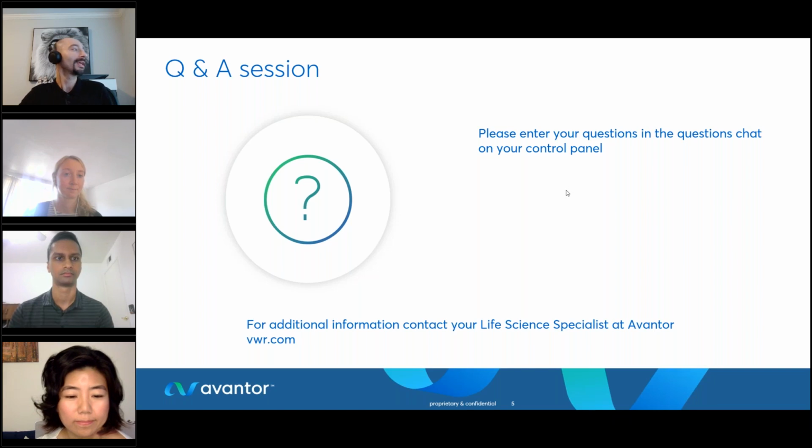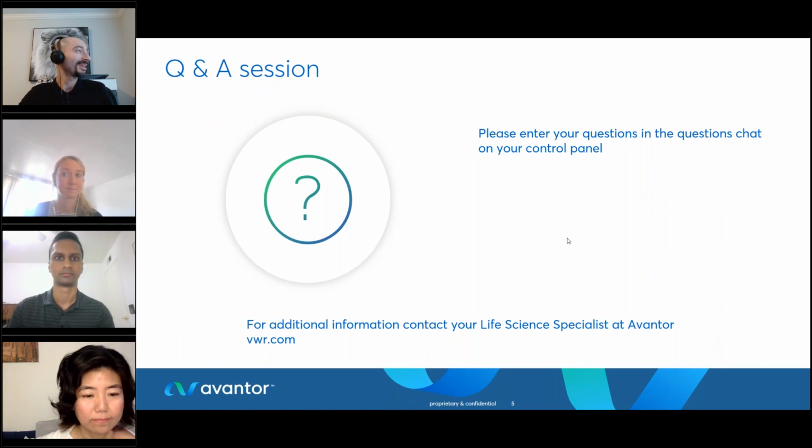Yeah. Perfect, thank you. The next question is for you, Sarah. What is the recommended sequencing depth or plasmid coverage to ensure a complete and high-quality sequencing using the Nanopore technology? So it depends on the quality of the data that you have, but for coverage, I would probably suggest going for 60x coverage. That's what we have set as the default for the workflow.